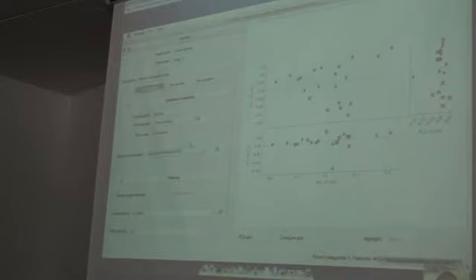So we can select this one for now. And then there's other options here about filtering based on the p-value or q-values that you get out of this. And this number of active features actually indicates how many categories are passing that statistical test. So we'll just leave that setting for now.